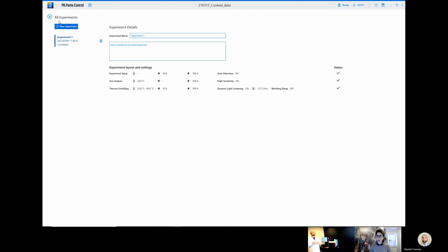You need to worry about your protein sample and the purity and cleanliness of your buffers. So you must use a filter to filter your buffers, keep them very clean, no dust. And this is all for the dynamic light scattering portion of the instrument. Clean buffers with no large particles will give you much better DLS.